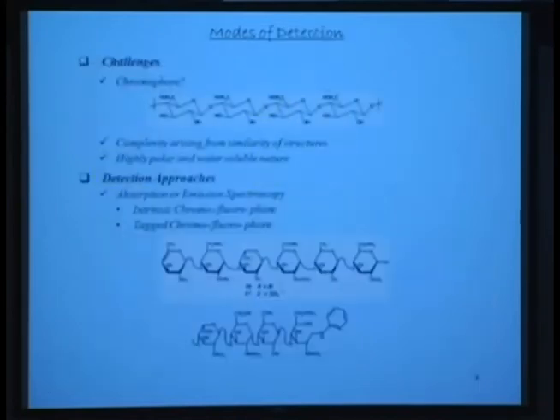Okay, good. All right, so obviously there are several challenges to sugar resolution. One of the challenges is something that we have talked about: when you have a polymeric sugar with these kinds of functional groups, there is, in essence, very little detectability.